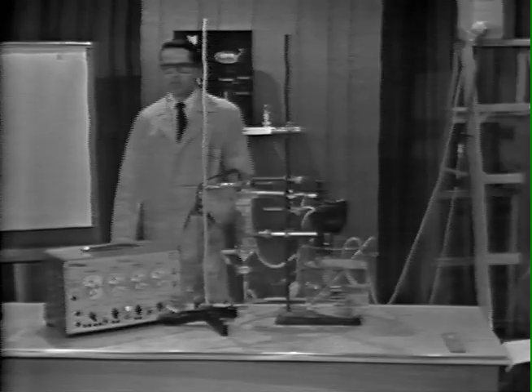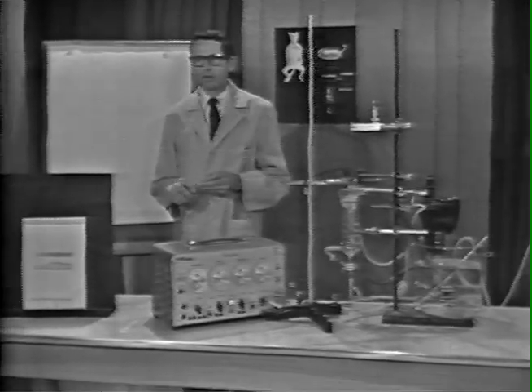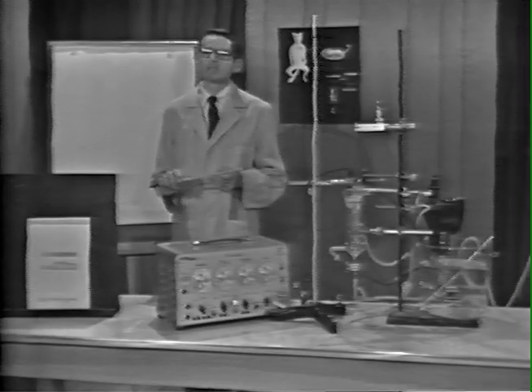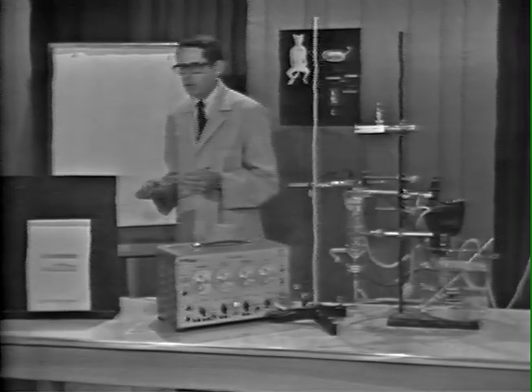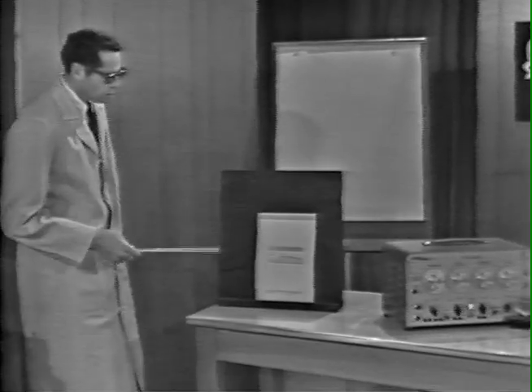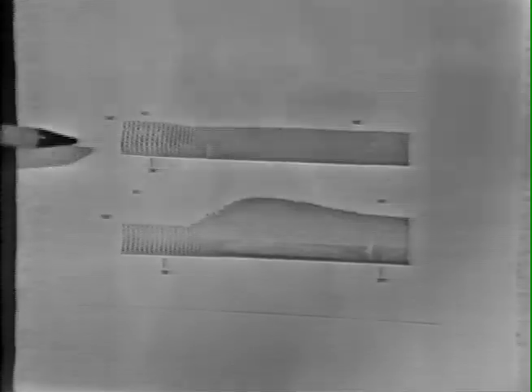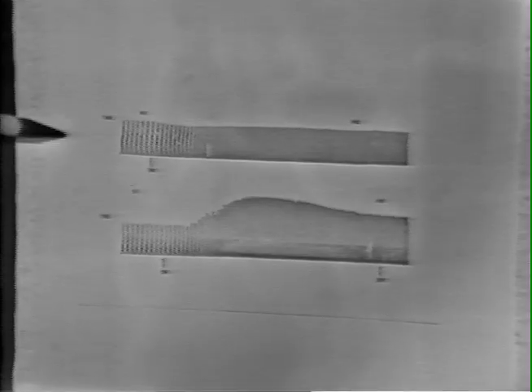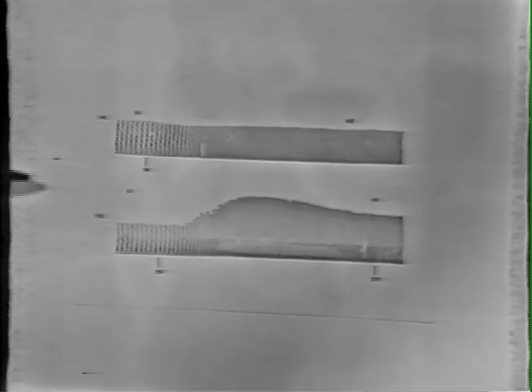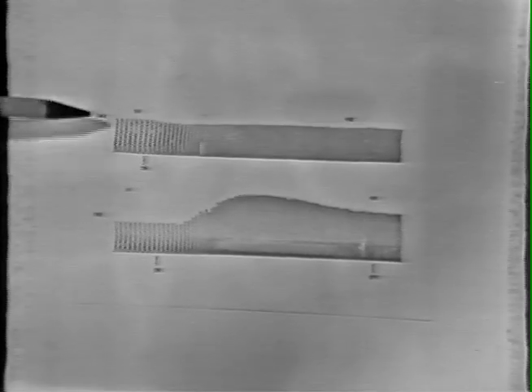Now, in this portion of the demonstration, we are going to be concerned with the responses to nerve stimulation. And we are going to attempt to modify these responses by adding an agent which is cocaine. Now, before we actually obtain some responses, let's take a quick look at what we might expect in the way of responses to nerve stimulation from two separate atria. We have polygraph recordings.